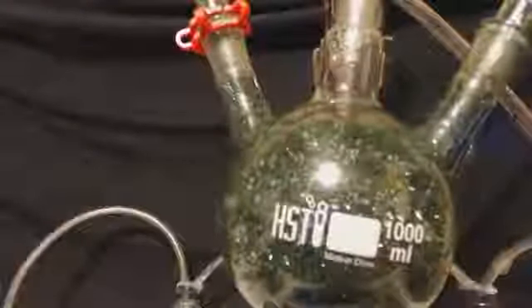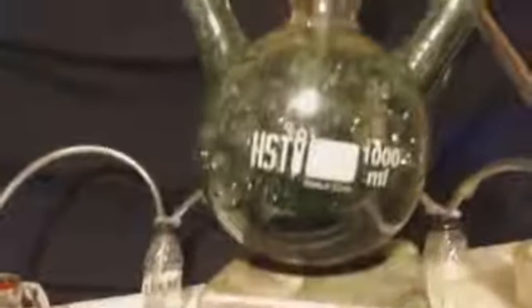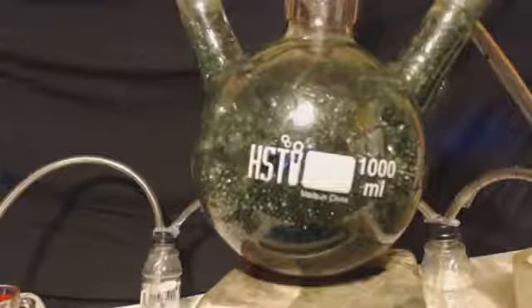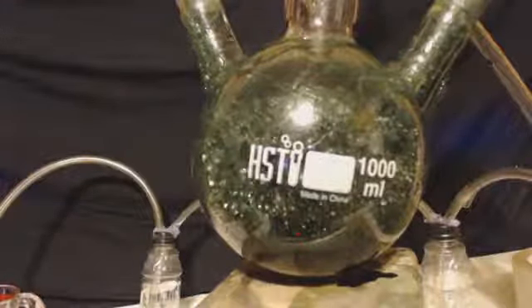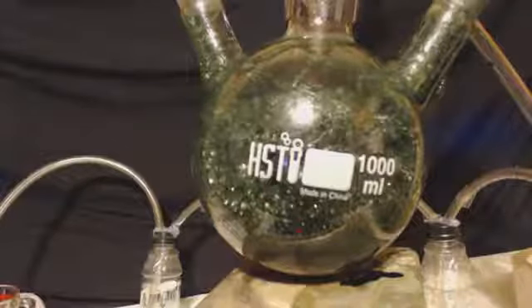But you can see that whole round bottom flask is all filled up, and that's mostly air. It's just foam, like when you open a can of pop and all that foam comes out. It's a little bit of liquid, but most of it's just foam. And if you watch here, in a couple of seconds it's just going to fall halfway down. I'm not going to let you watch it all fall, but the major big fall is pretty cool. So I got all those pieces that had the foam on them, and I put them in water and collected it all up so that I didn't lose any product.